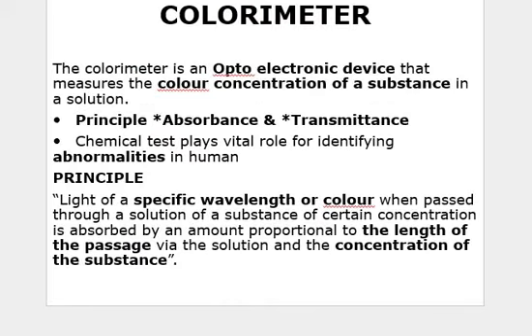First we are going to discuss this colorimeter. Frequently I say that the answer for the question will be given as a hint in the question itself. So again, here is a question. What is this colorimeter? Colorimeter: the color is hidden in that word. In order to find the color, the color output from the sample is called colorimeter.